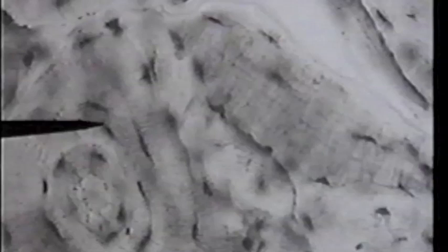Those streaks are actually very small canals that radiate away from that lacuna. Those tiny little canals are called the canaliculi, meaning tiny canal. Extensions from the osteocyte in life are found in those tiny canals.